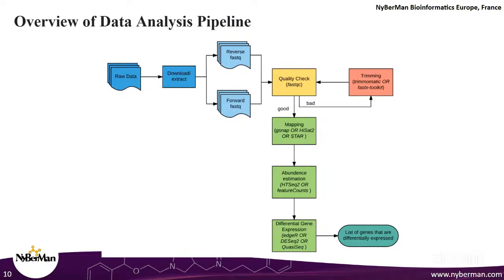You're going to basically pick each of these reads and place it at the positions where you think it matches the human reference genome. Okay, that is literally and figuratively what you will be doing in the alignment step, or sometimes people also call it mapping. The most commonly used tools are HiSat2 and STAR, out of which STAR is considered to be the gold standard.